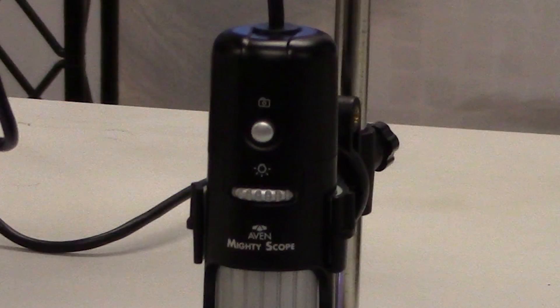All Mighty Scope units offer an image capture button on the microscope body as well as in the software, allowing for maximum flexibility at no additional cost.